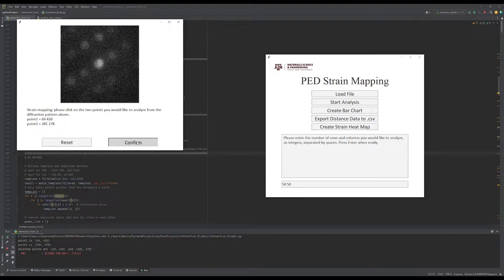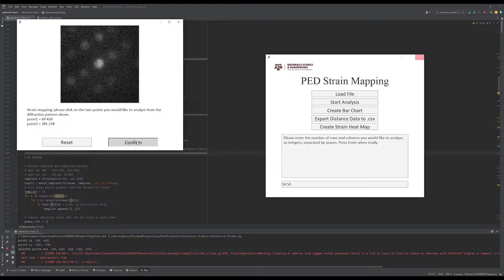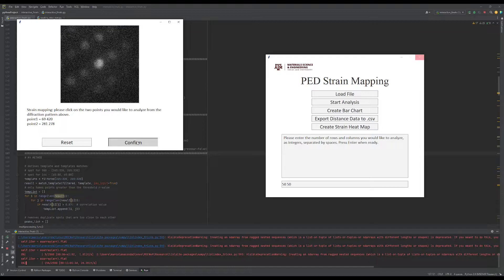Depending on the data set size and the computer running the script, the calculation time will vary. This data set took roughly two minutes, while a similar 200 by 200 data set takes half an hour.